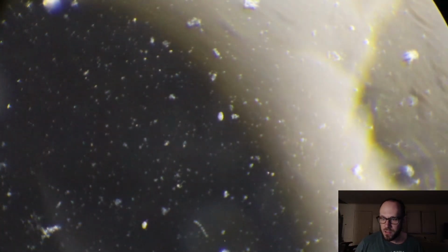Just all these little guys swimming around. Let's go to 100x. It's no wonder why early sci-fi writers used microscopic life as a basis for space and alien life. Oh yeah. That makes sense. What, is this not centered? What the hell?